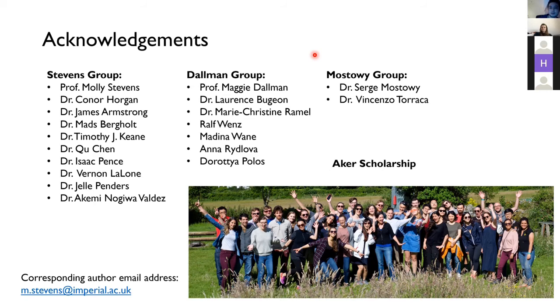I mean, compared to fluorescence, I think that's kind of two completely different imaging modalities. I think for most of your experiments, you want to start with some kind of fluorescent imaging or histology, because in Raman, if you want to perform Raman on zebrafish, you really need to know what you're looking at. You need a very, very clear hypothesis that you can investigate.